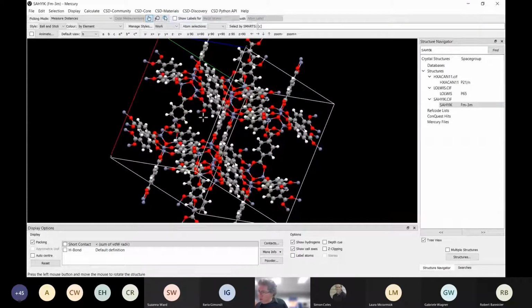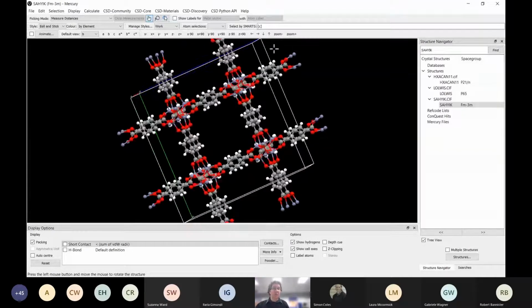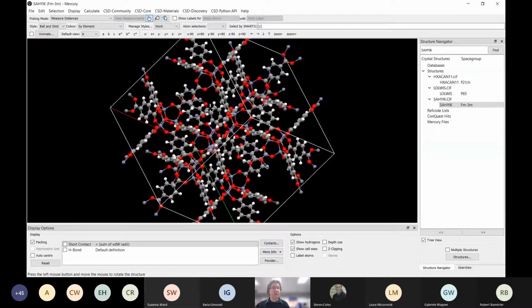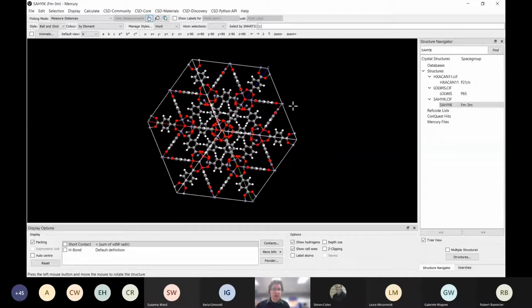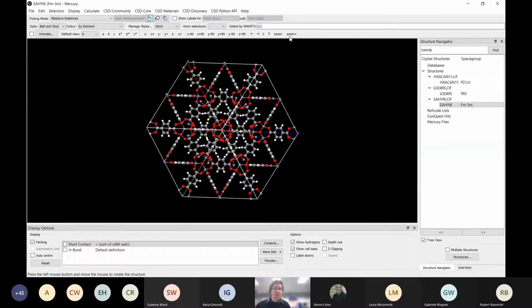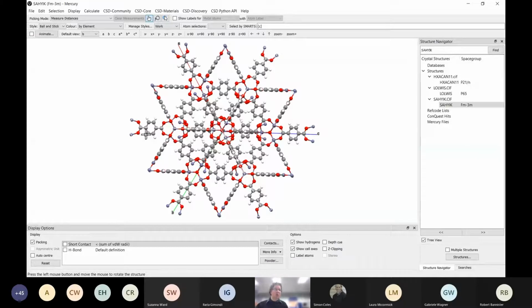We've got measuring distances, but one of the next things is that we can get nice pictures. One of the reasons for doing this is that you've done your packing, you've got it the way you want, and you want to get a nice diagram out. So, have it around a little bit. Let's have it there. Zoom out a little. If I'm going to have a diagram, I probably want a backdrop, so I'll have it as white. That doesn't look too bad. As I say, you can do what you like with the diagrams. It's your choice.